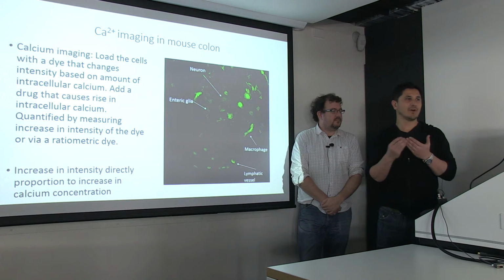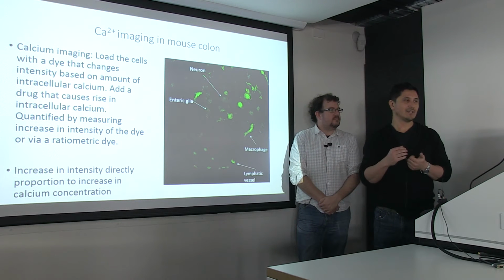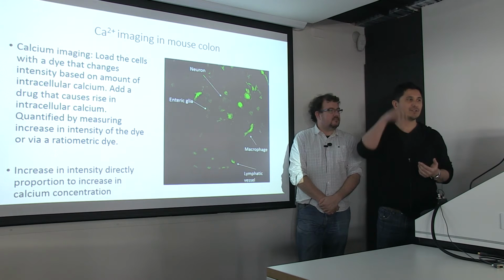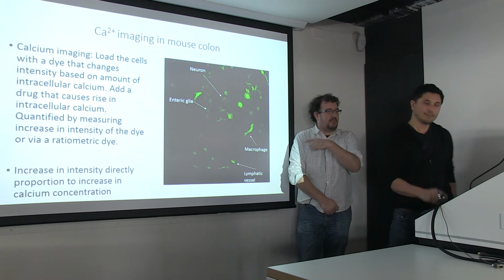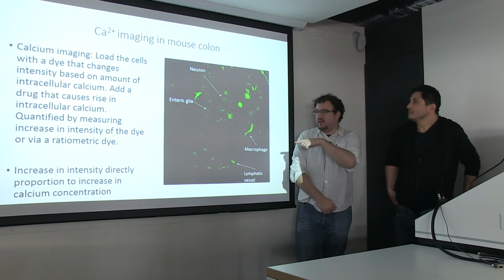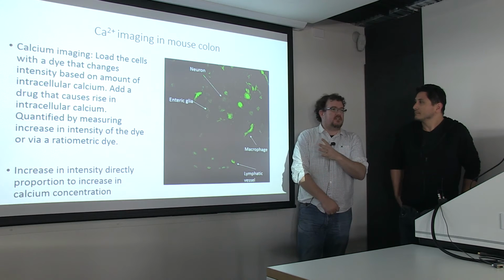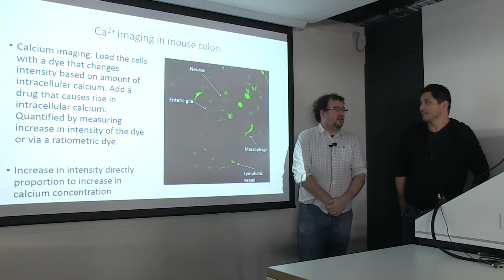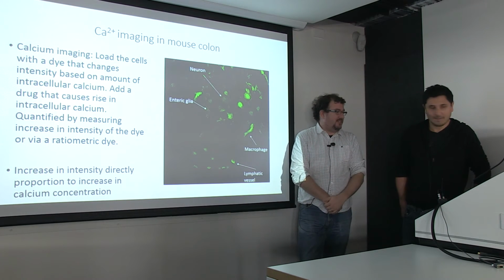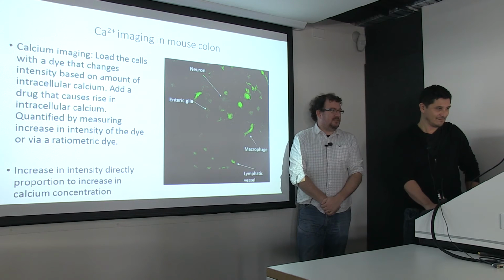Basically, this dye allows us to measure which cells respond, the rate at which they respond, and also changes, for example, in oscillatory activity. From that we can also pull out the temporal and spatial locations of each of these cells. So we can ping each cell, tell you its individual response over time and where it is related to every other cell in the image. But the issue is then hopefully being able to turn that into something more sensible. Exactly.